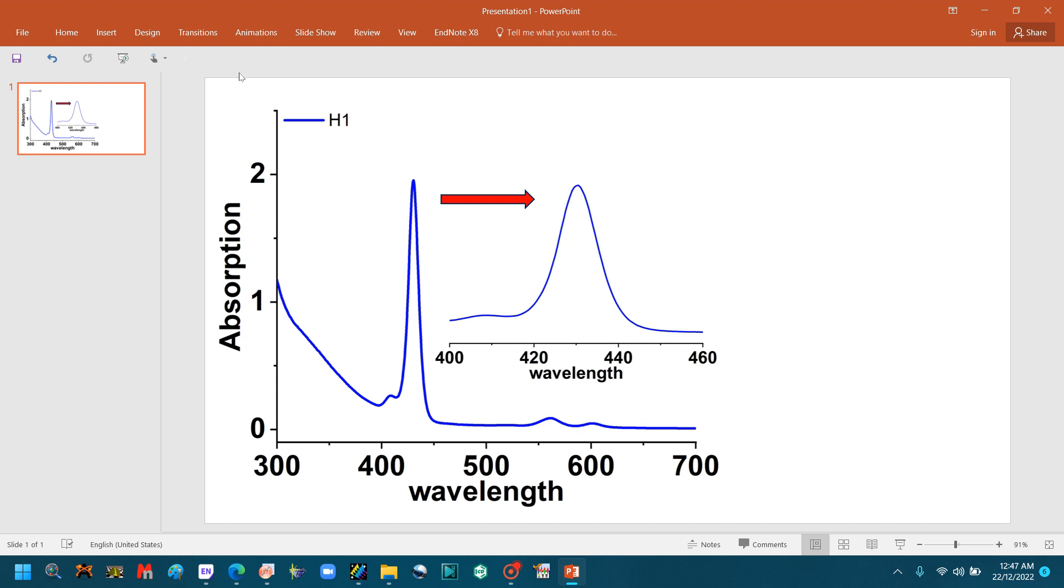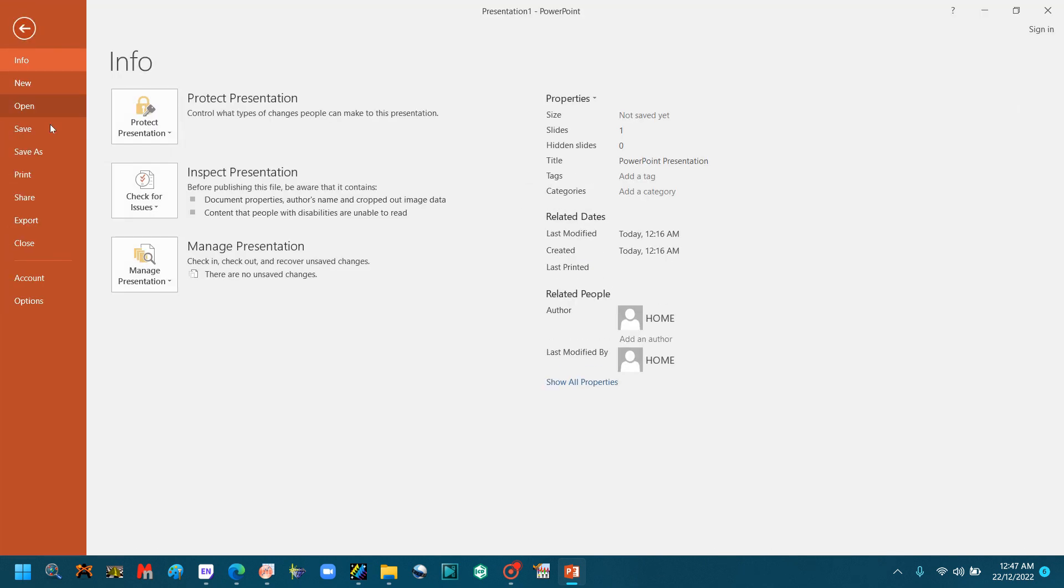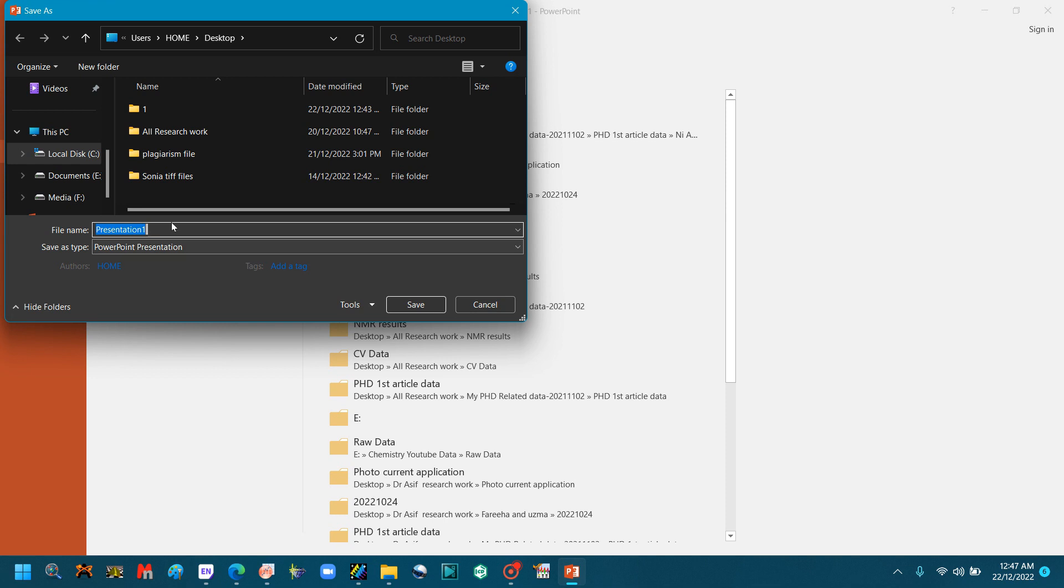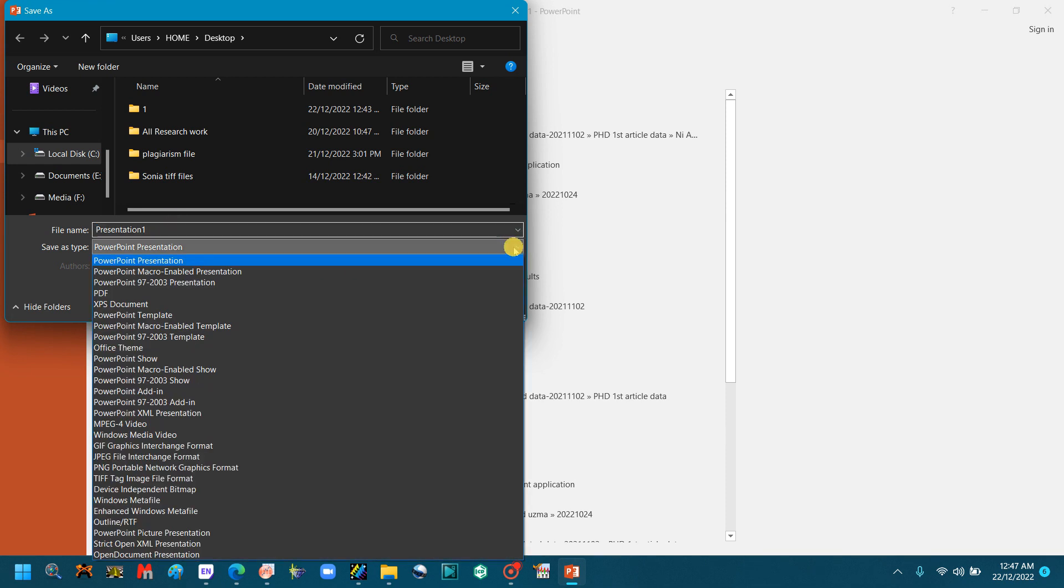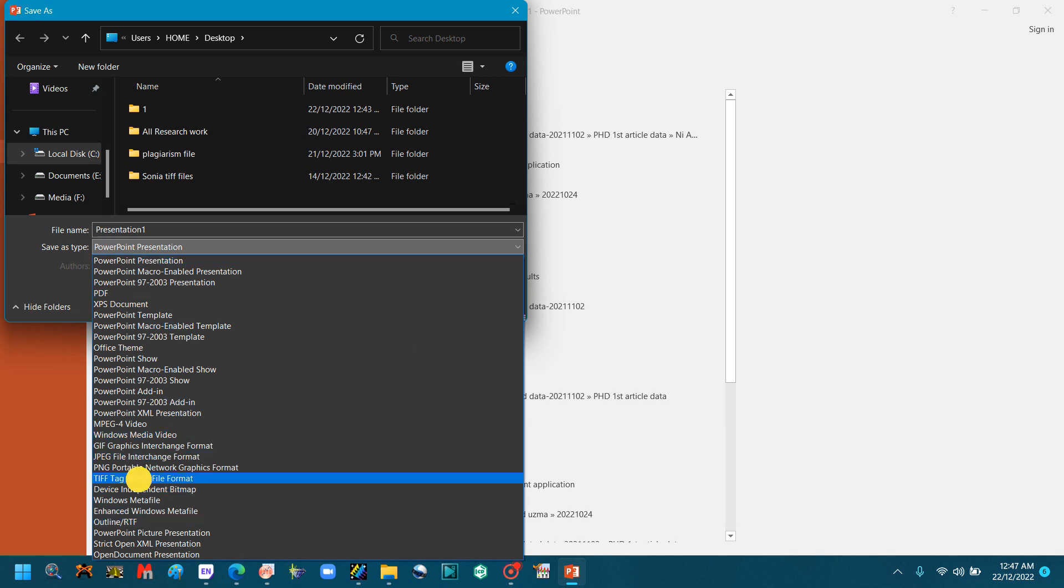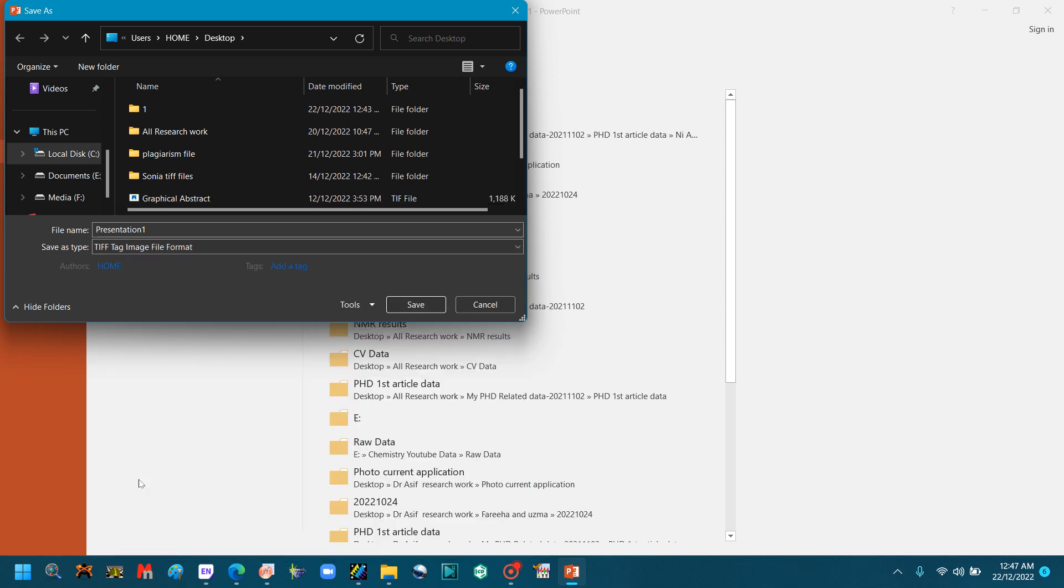I think this is enough. Now you will make a TIFF file of it. Go to File, Save As, go to your folder, select Save As Type: Tag Image TIFF. Click Save.